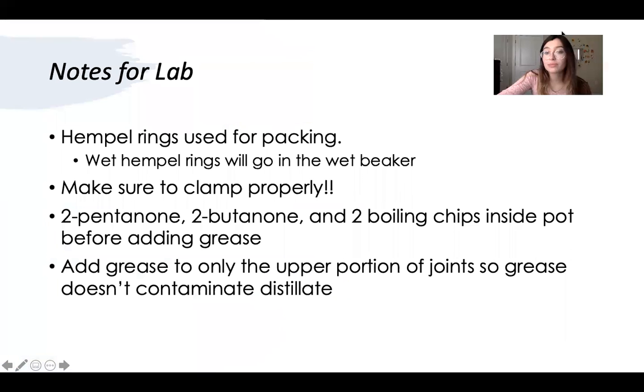Notes for lab, or something to keep in mind. We're going to be using rings for the packing. There is going to be a wet beaker ring and a dry beaker ring, so make sure that you guys do not throw these away in the trash. Make sure that you clamp properly. It's very important to clamp properly because your glass can fall and you can break it.